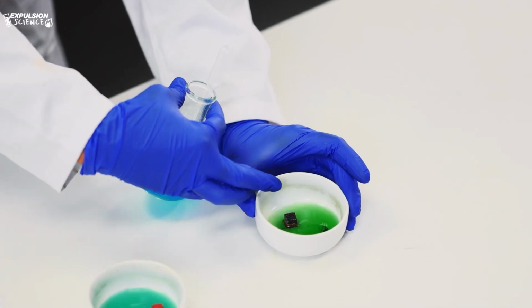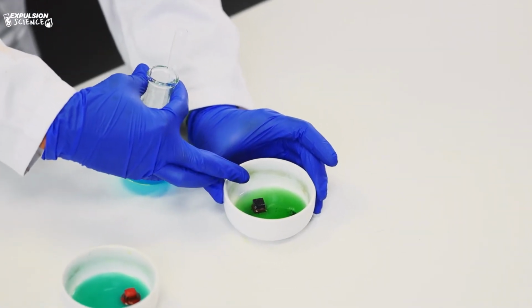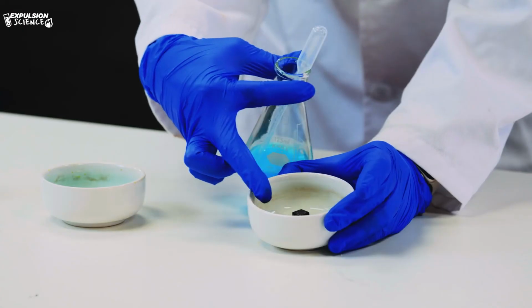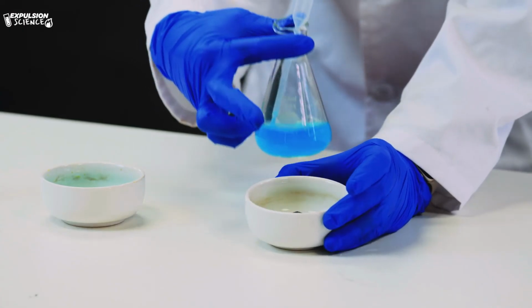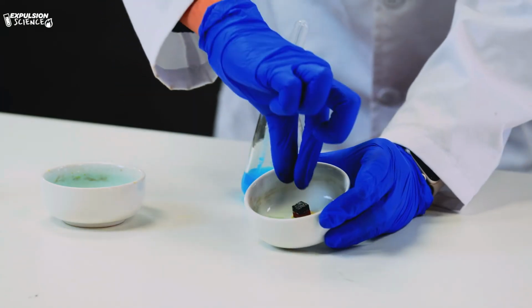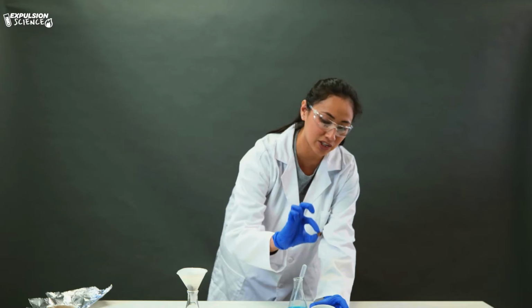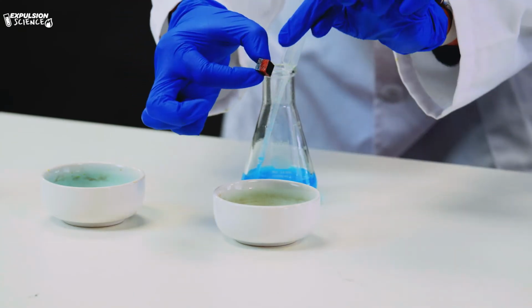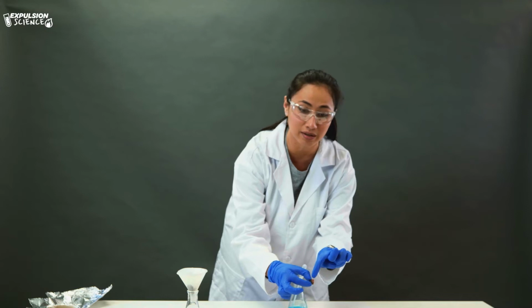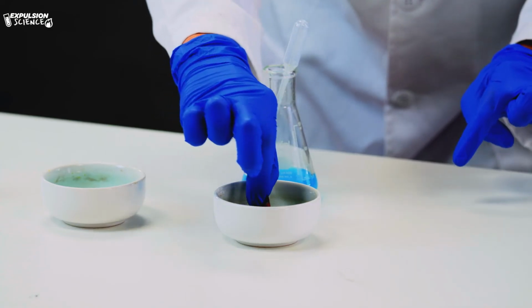So the tin metal has reacted with the chloride ion in the copper 2 chloride solution. This green compound that you're seeing here is actually tin 2 chloride. And then if I pick up my block here, you can actually see that there has been corrosion, and that corrosion that you're seeing there is actually the copper metal. I'm gonna set this back.